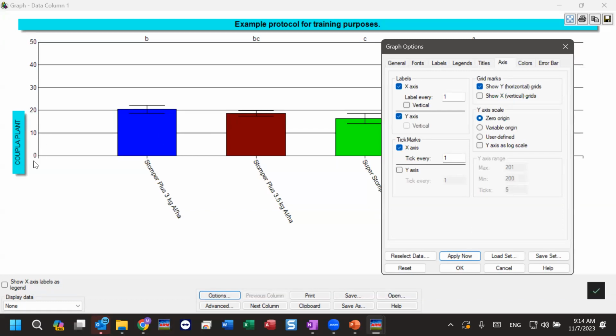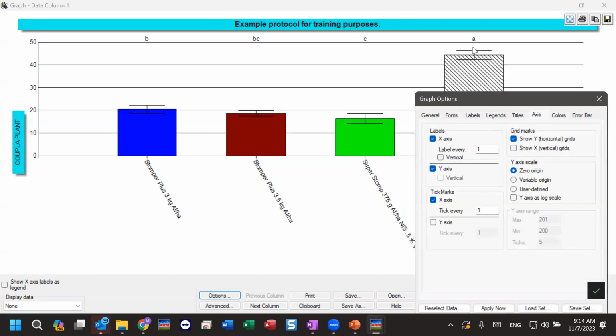So that controls the scale for which the data is on. And so if you wanted to adjust kind of manually, so by default, I've got this 0 origin. So we'll make sure that 0 is always the very first one, but then ARM just kind of determines based on the data what's a reasonable spot to stop at. But if you did want to override that, you sure can.